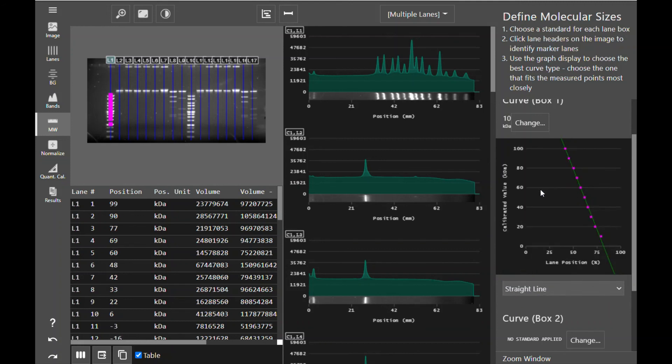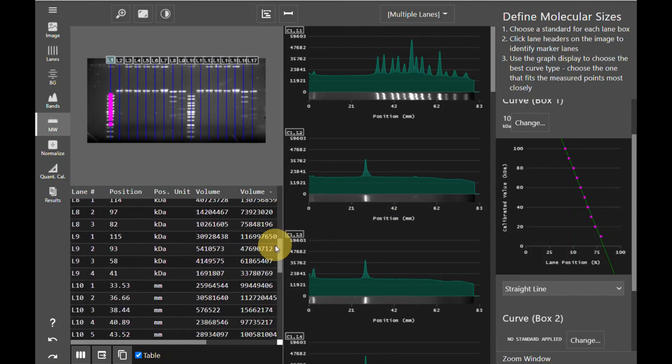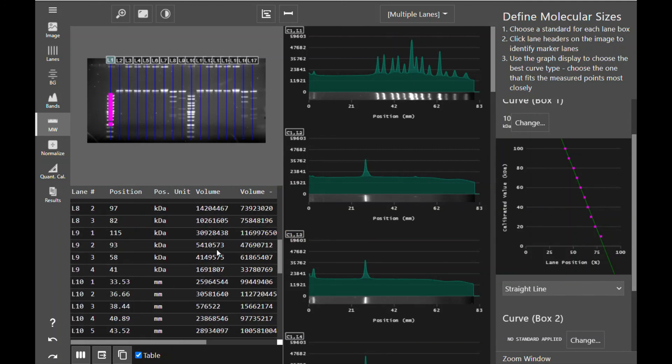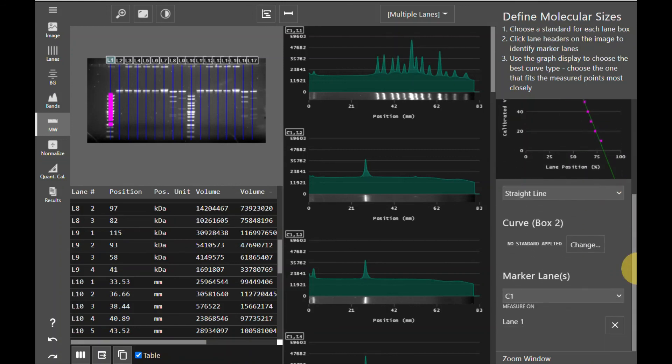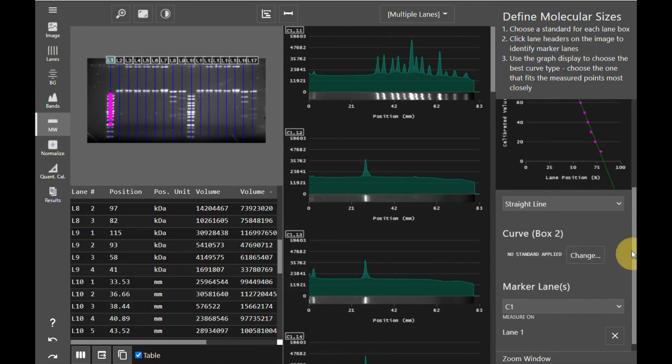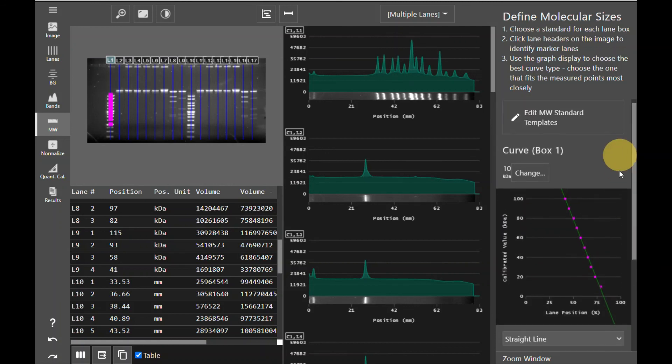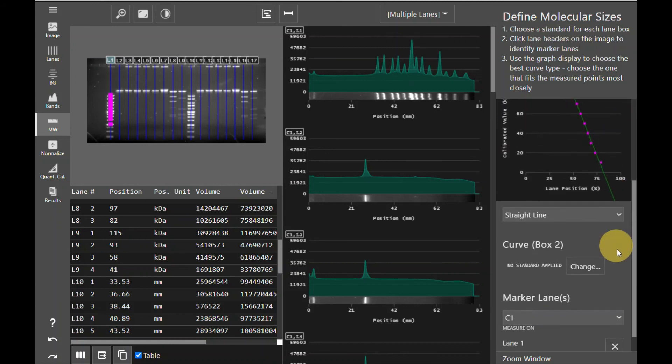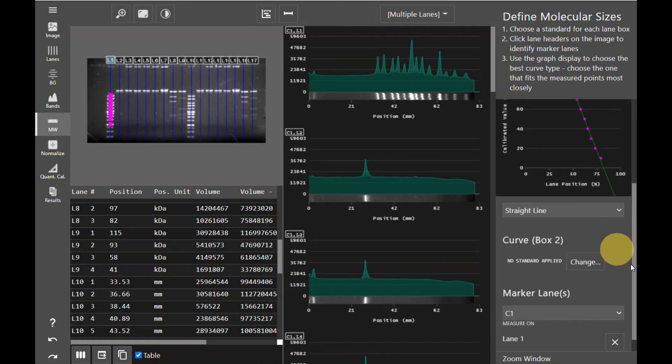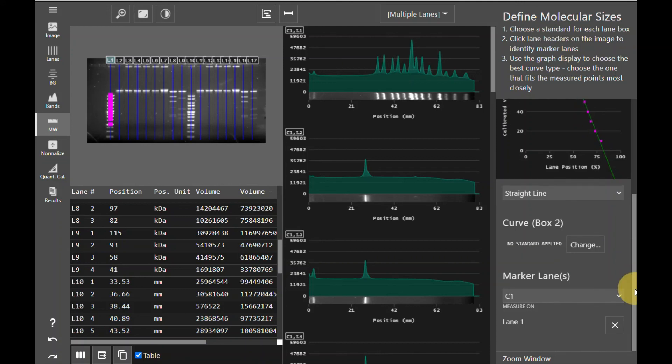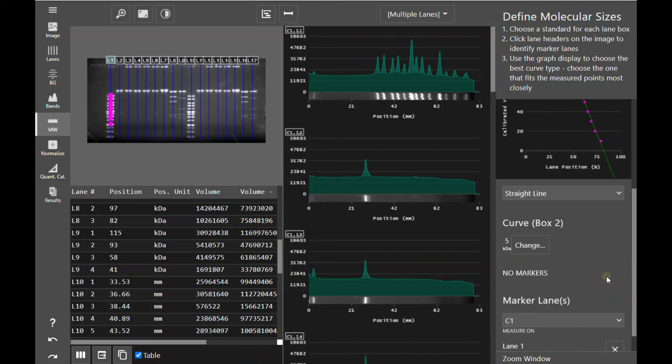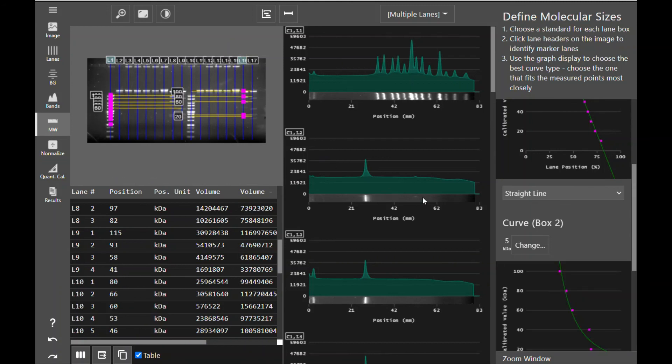You can choose the line fit for your curve based on your SOPs or the manufacturer's directions for your standard. Once you have set your curve, you'll see that the position and position units have updated in the data table to reflect your template being applied to that gel. You'll also notice that because I created two lane boxes back when I created the lane boxes, there are two curve boxes. This would allow me to apply a different template to my second gel if I decide to do so.